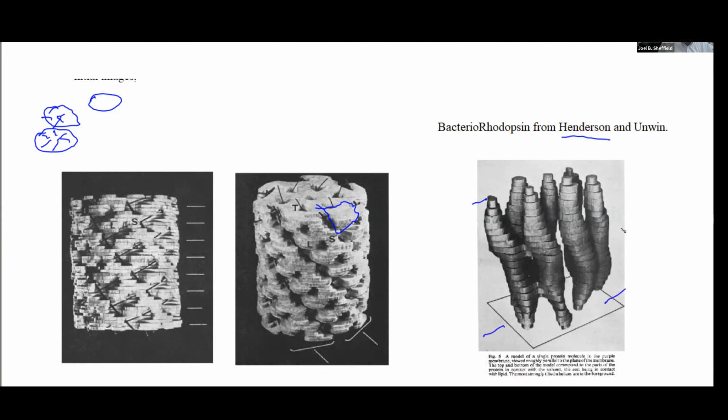They had super thin arrays of the bacteriorhodopsin, which is known in a membrane to sit, if this is your membrane in the bacteria, like this, as a set of transmembrane helices, okay? And this is the image they came up with. So what happened was that basically Klug developed the mathematics for analysis of these kinds of images.